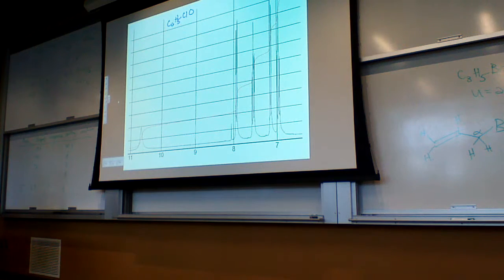We have a chlorine there, but that wouldn't have the OH on it. Alcohol. So in this case, we know it's an aromatic ring, right? So we need 6 carbons to make the aromatic ring. And that leaves us with no more carbons to make a carboxylic acid. We also don't have 2 oxygens, so we can't make a carboxylic acid. And so in this case, it's just a phenol.